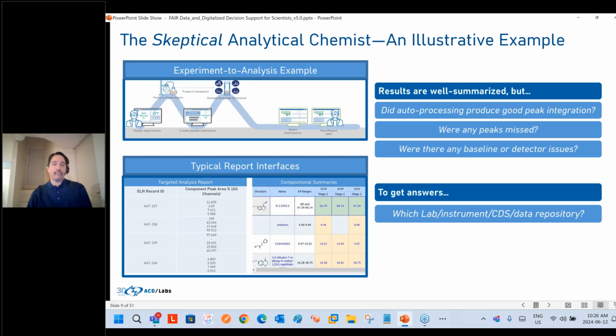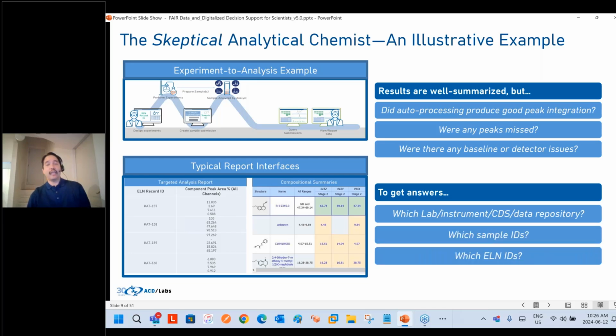So at that point, they would, let's say, find the sample ID number or ELN number. And that again creates a disconnect for an end user where they're just going back and forth still. So really the focus, again, is on the curation aspect when you have all the data together before publishing all your results into these applications.